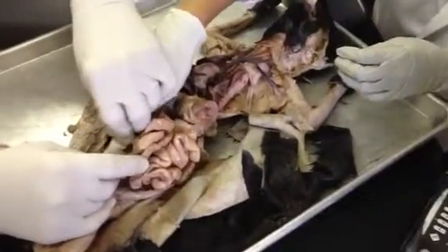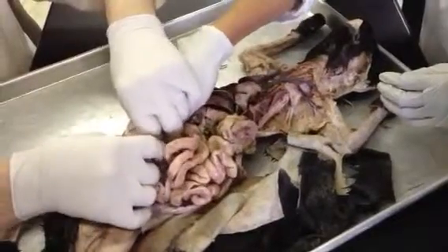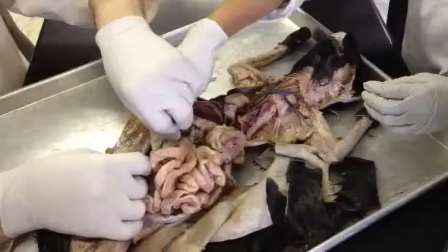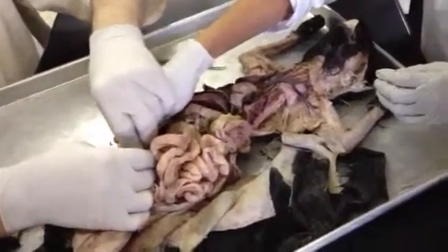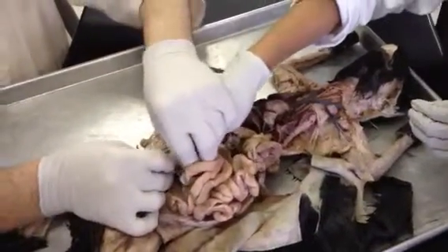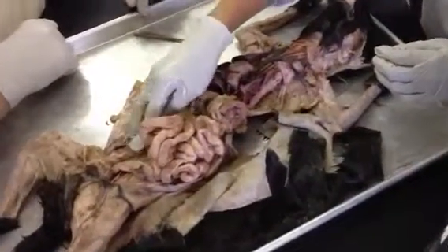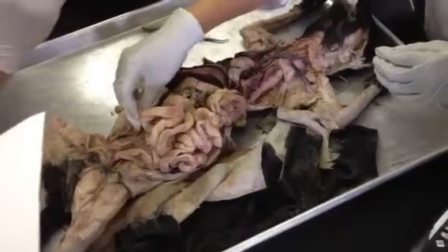This is the ileum coming in to the large intestine right there. That's the large intestine heading upward. In a human, this would be the ascending colon. Down here, this dead end pouch right here, that's the cecum. And there's the intestine coming in right there. Is that making sense? Yes. But this is the pouch. Yep, the cecum is the first part.